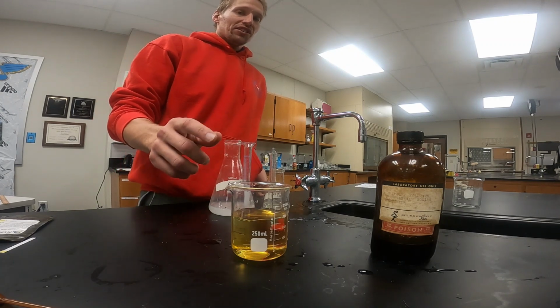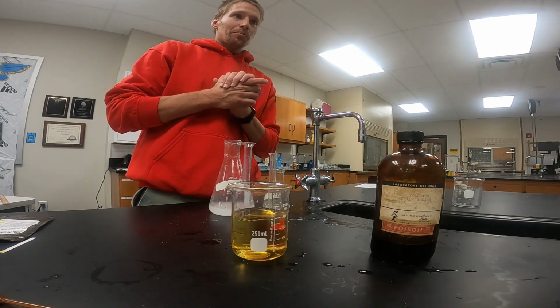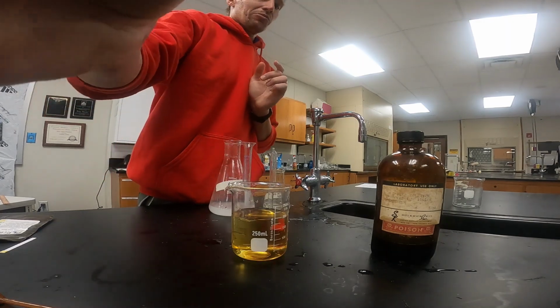Next, we need to create a cellulose tube. We'll do that, and then catch you once we have the tube ready.